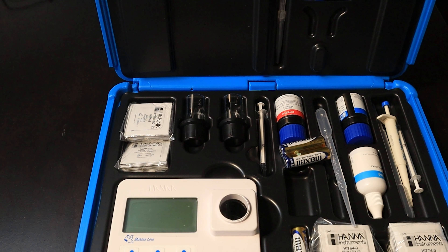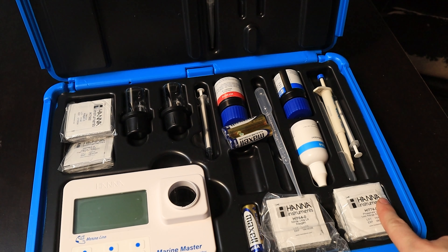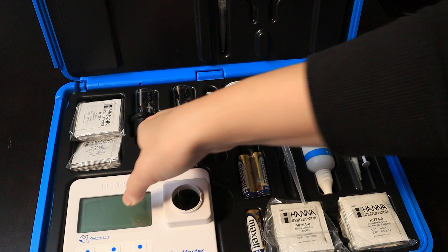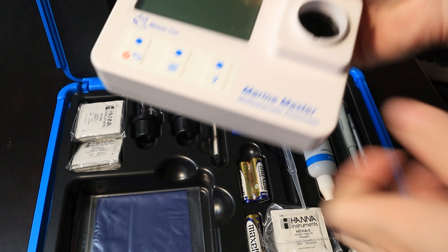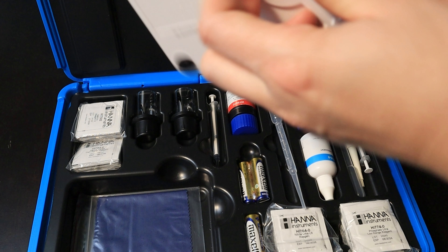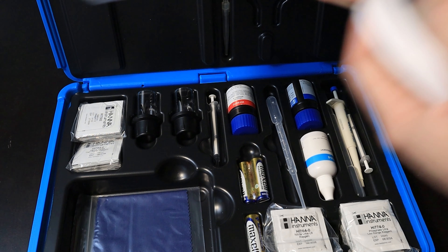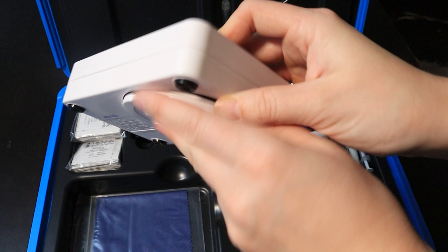Okay, it comes with a bunch of reagents — I think most of these will give you like 25 tests or something, so they'll last you a little while. The machine itself is pretty small, not that big. The good thing about this, though, is you can easily change the batteries out. Before, I was missing screws and the backs of my Hanna checkers were coming off. But there's that — goes right back on.